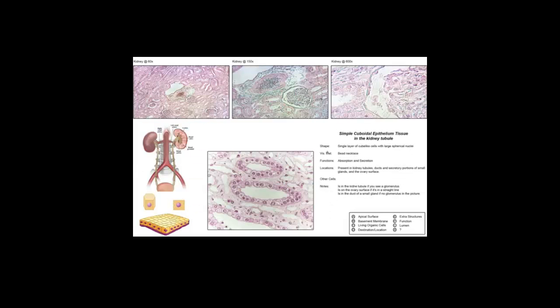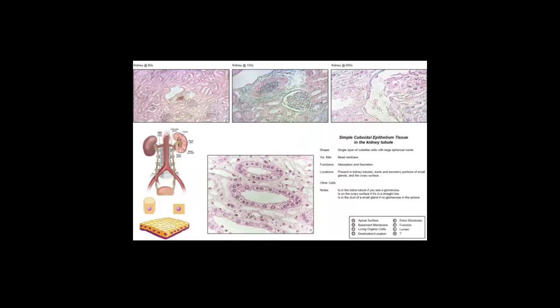Okay, this is also a kidney slide. The same structure shown is just a different view at a different level of the kidney that shows obliquely cut kidney tubules that normally are quite circular in nature as they move through that area. Here are some of them at lower magnification that are circular, and if you cut it at an oblique angle, many of them might appear as an oblique structure like we see here, or fully magnified right here. Here, kidney tubules are lined with a simple cuboidal epithelial tissue that has the ability to secrete or absorb the filtrate's materials in and out.